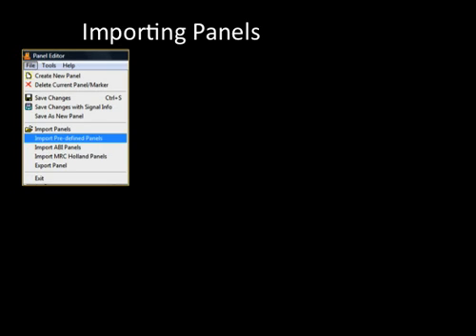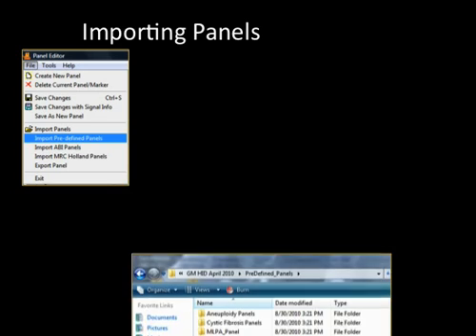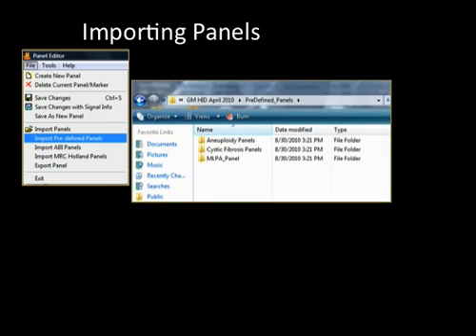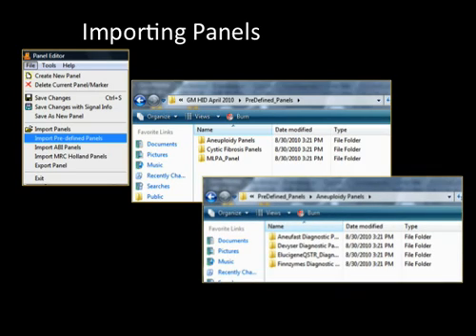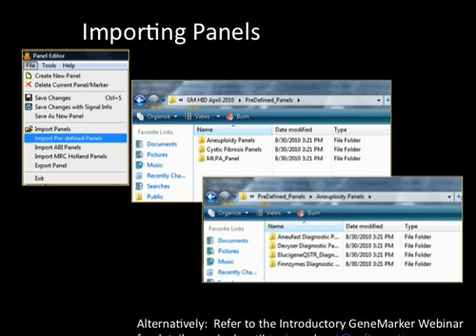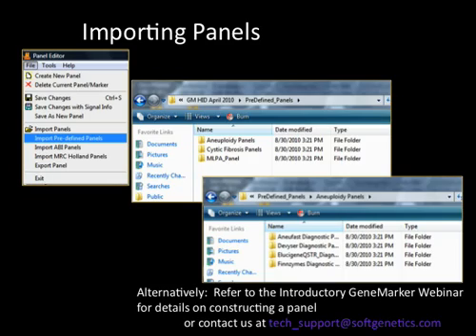Select File, Import Predefined Panels, and open the Aneuploidy Panels folder, then select the appropriate folder for your chemistry. Alternatively, custom panels are easily constructed using the panel editor. Details are provided in the introductory GeneMarker webinar or contact us at techsupport@softgenetics.com.